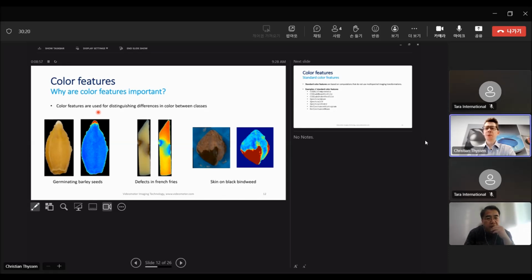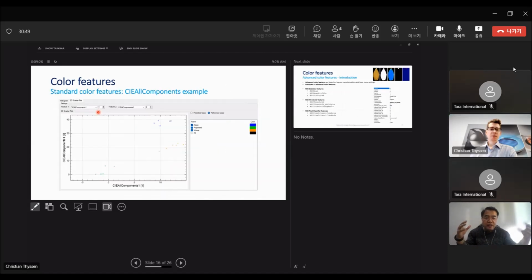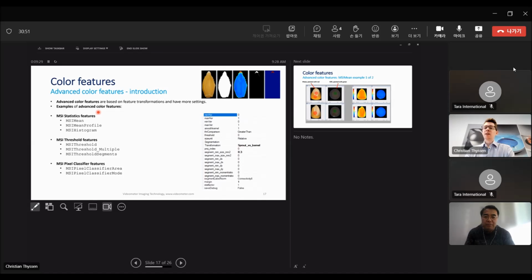You mean the pixel classifier, or which one? Sorry, did you mean? I need to summarize the questions. Sorry about that. Yes, okay. The question was about the blob function, but you described the CDT, especially the color picture. Okay, so I mixed the two things. Maybe when you see it in action, it makes more sense.